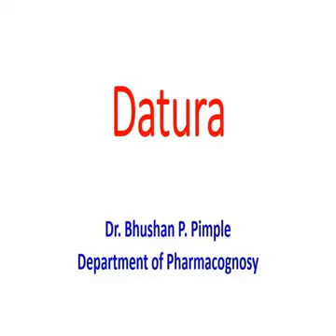Myself, Dr. Bhushan Pimple. In this session, we will have a look at the morphology, that is external appearance, and microscopy, that is anatomical architecture of the plant Datura.